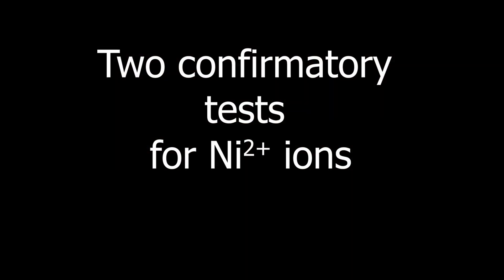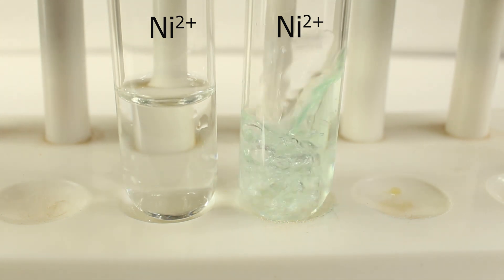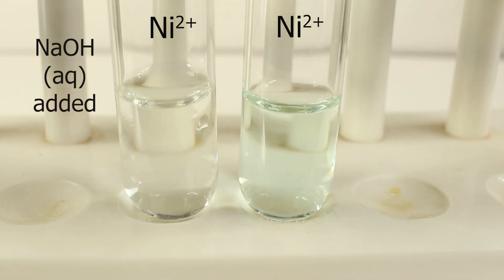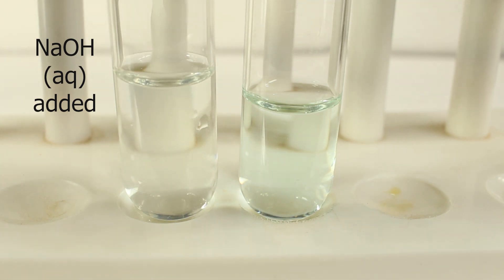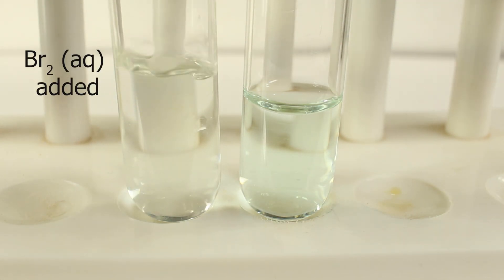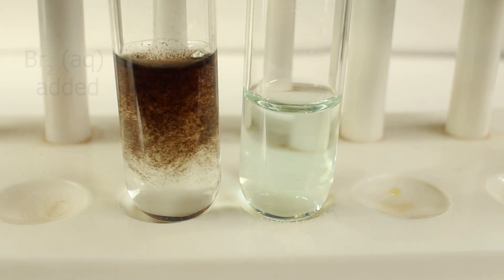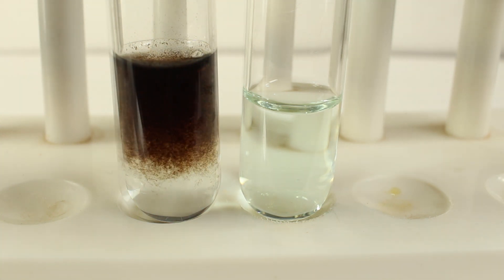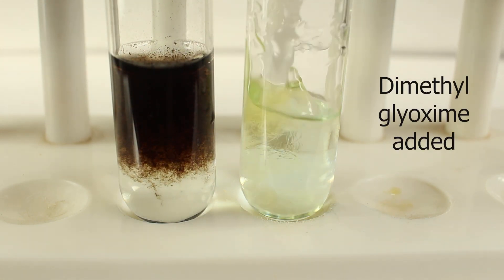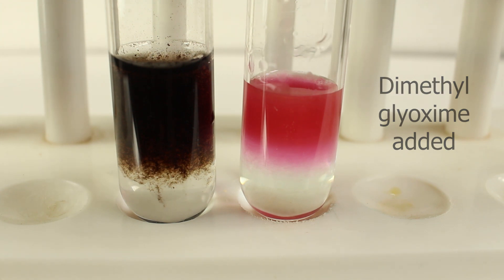Let's run these two tests in fast sequence. Without any control — low concentration of nickel for the sodium hydroxide/bromine water test, and high concentration of nickel for the dimethylglyoxime test. Addition of sodium hydroxide forms a hardly visible precipitate, and bromine water develops it into a very distinct black precipitate of nickel-3-hydroxide. Dimethylglyoxime solution added to nickel-2-sulfate solution makes the characteristic raspberry red or bright red precipitate.